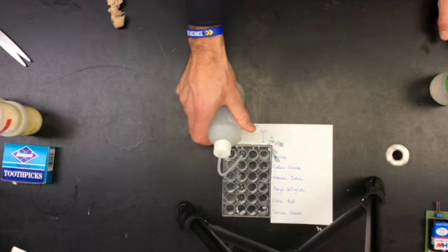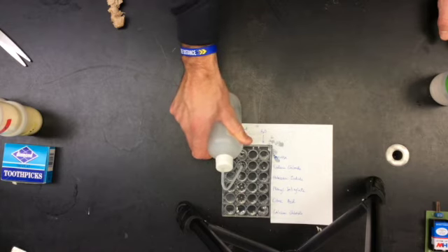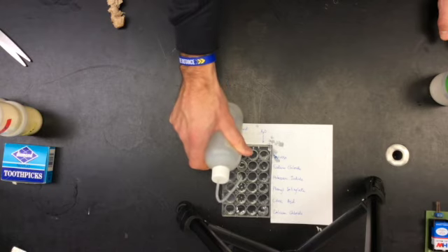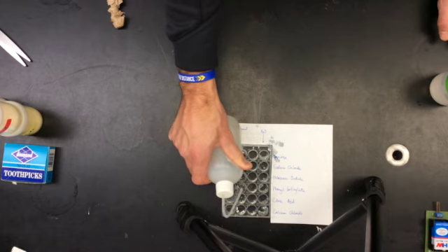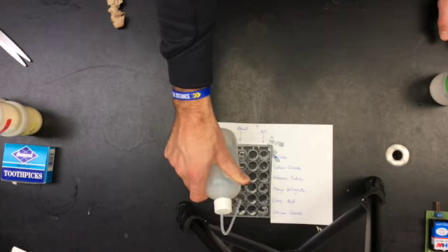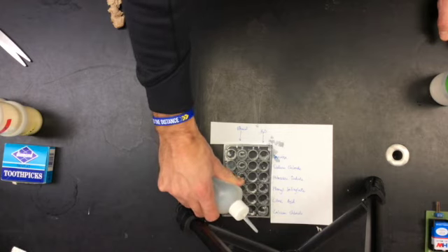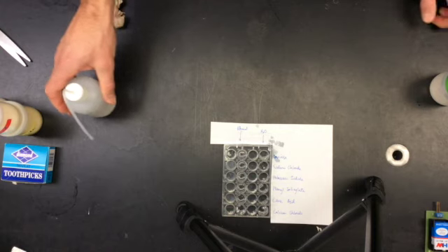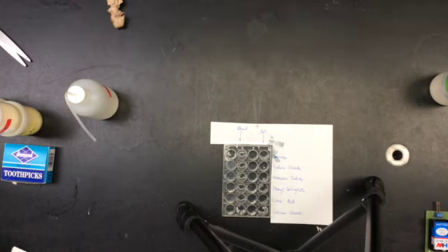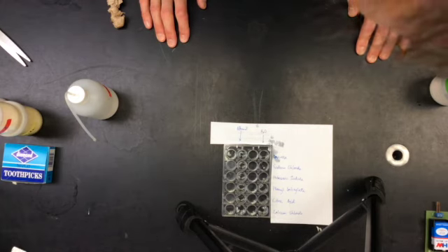We're going to do the same thing here with the ethanol. All right, so we will let those ones sit, and then you will get to make the distinction.